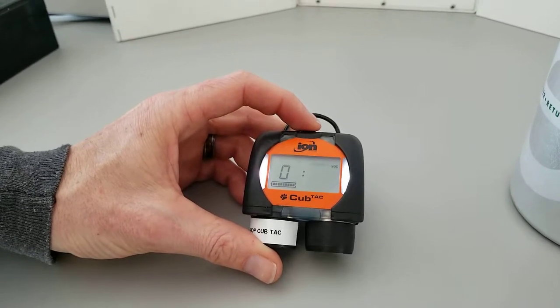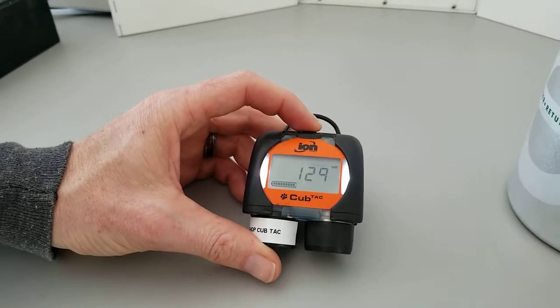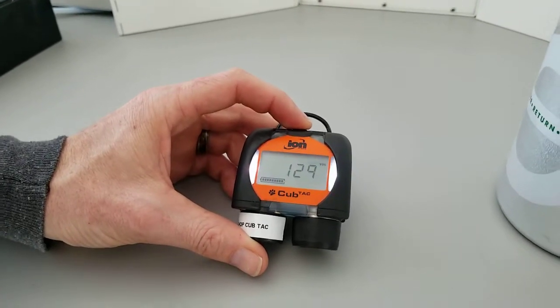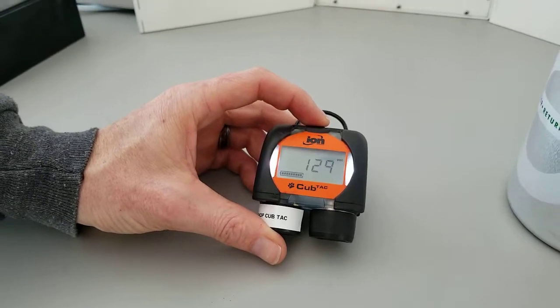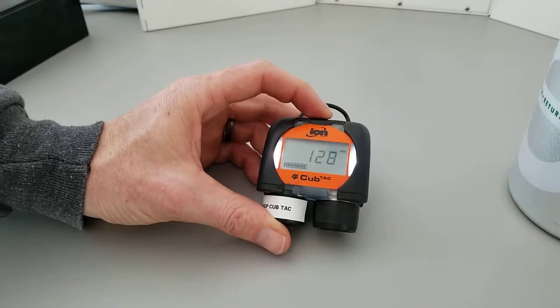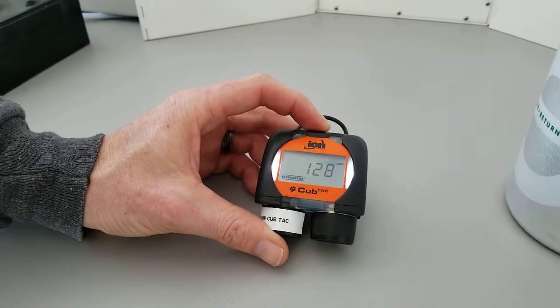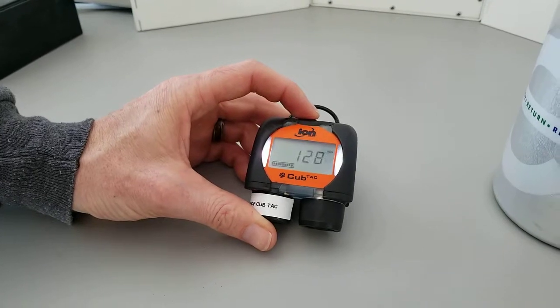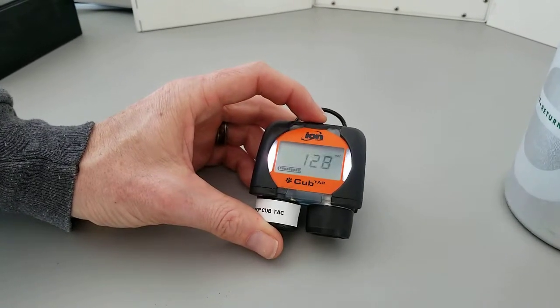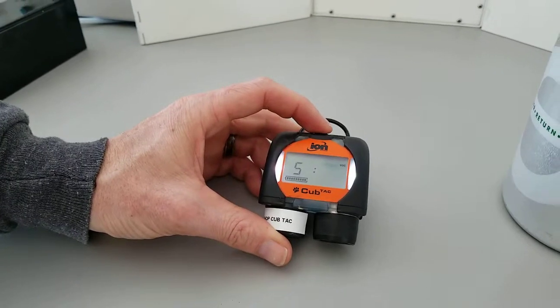We're now seeing zero on the screen — we are in the first half of the calibration routine. We press the button to proceed. The unit now shows a digital representation of the signal. We don't mind what the number is, but we want it to be stable. Right now this is a very stable number, so we press the button. The instrument is now learning the calibration.